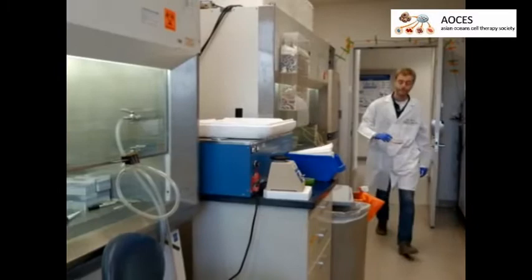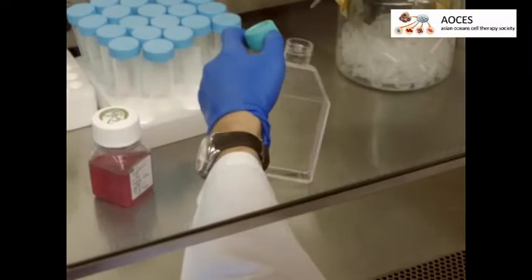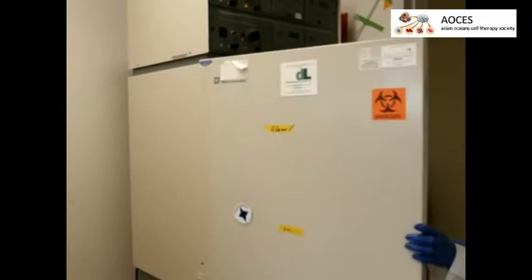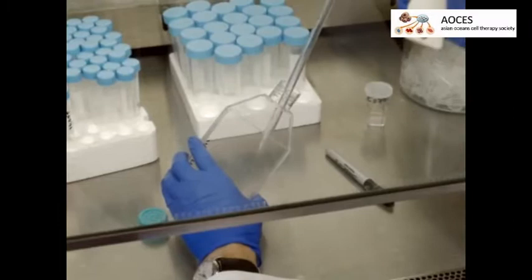To begin, remove a culture dish containing adherent cancer cells from the incubator. Wash the cells once with PBS and add 1.5 milliliters of 0.05% trypsin EDTA. Then incubate the cells for three minutes at 37 degrees Celsius.